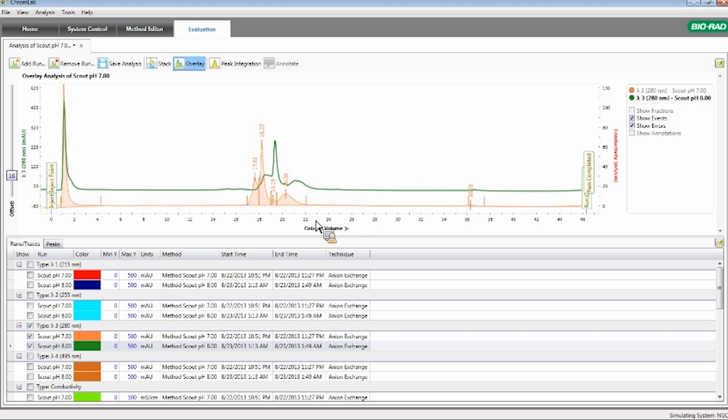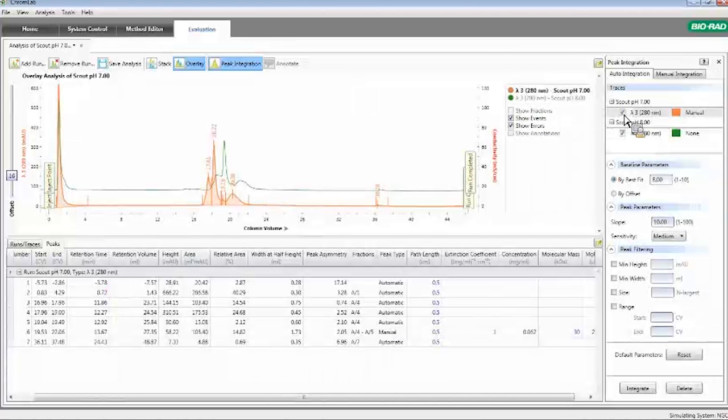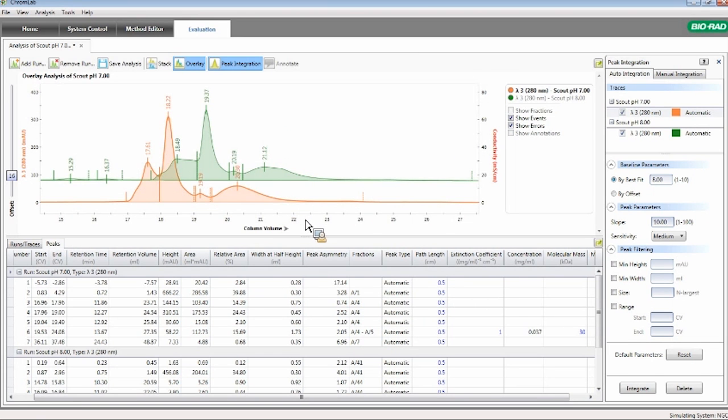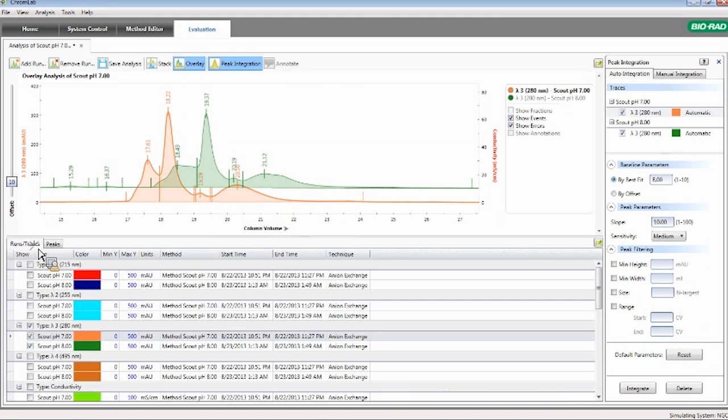We can also use the peak integration function, and we can do an integration of both traces here. And finally, if we have an area that we really want to zoom in on, we can do so just by doing a zoom feature. So you can see that by using many of the tools that were introduced throughout the presentation so far, you can really bring out the data that you wish to display for the purposes of doing presentations with this data. And you can adjust it accordingly, and you can color the traces using the change in the trace color features.